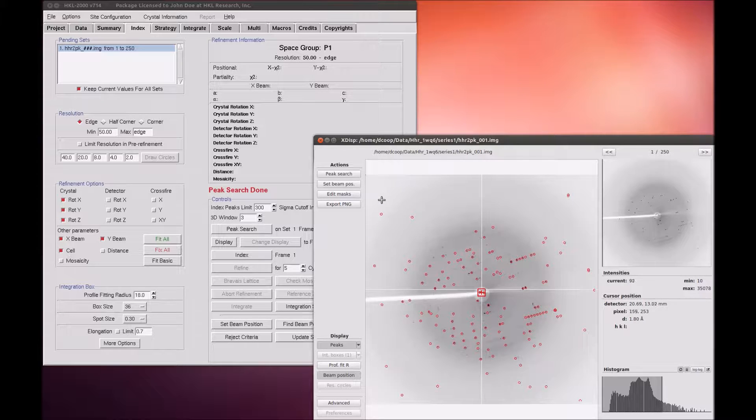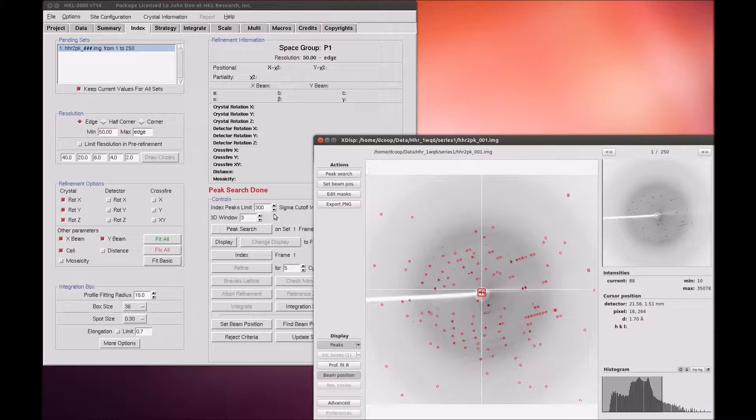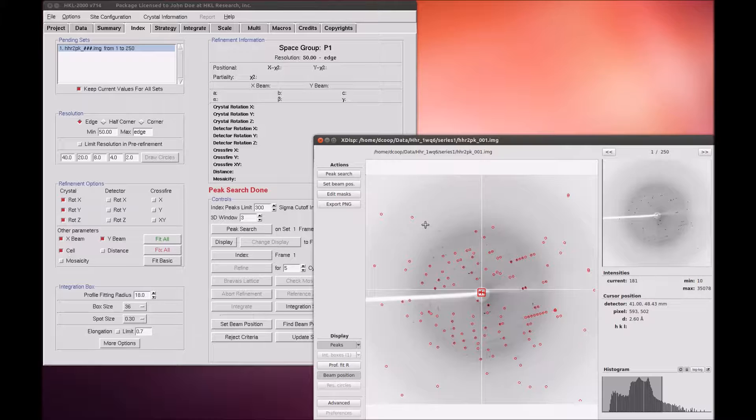The Automatic Peak Search button will pick peaks from several frames, using the number of frames set in the 3D window option. XDISP-QT will pick peaks from all of the frames before displaying the image, so expect a slight lag if you set the 3D window high.